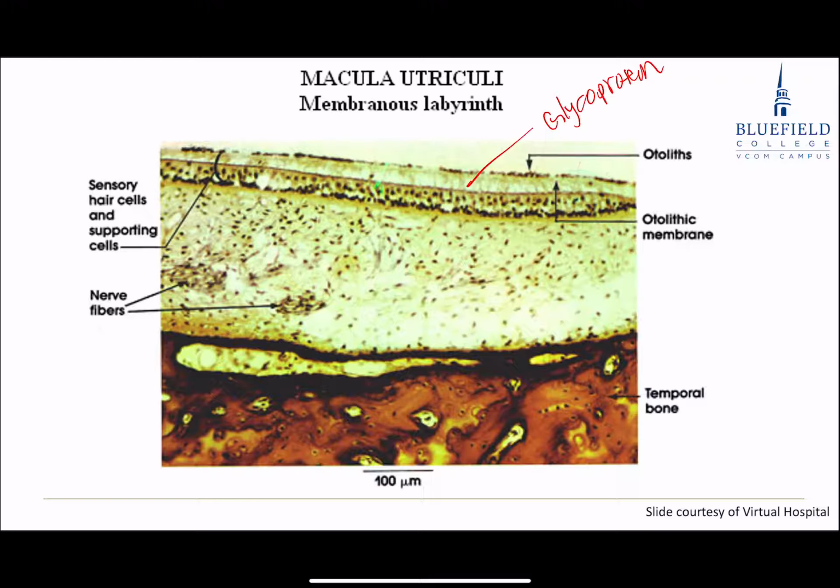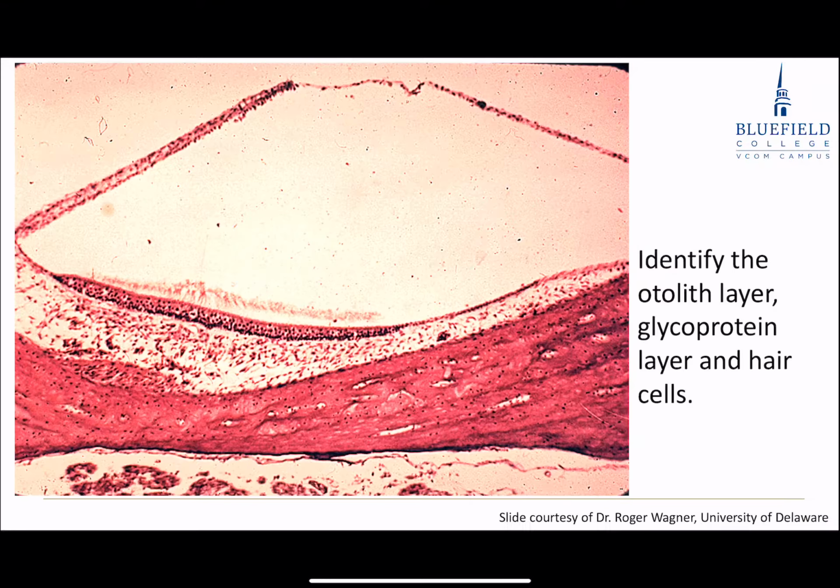There are guidance structures I did not talk about within the utricle sac. You'll ignore this up here; most textbooks ignore that. The otolith organ is down here. Once again, I've got bone down here in pink, and connective tissue, and you get the idea something's passing through it. That would be the dendrites passing through there. Nuclei-wise, it looks like a pseudostratified epithelium, something along those lines.